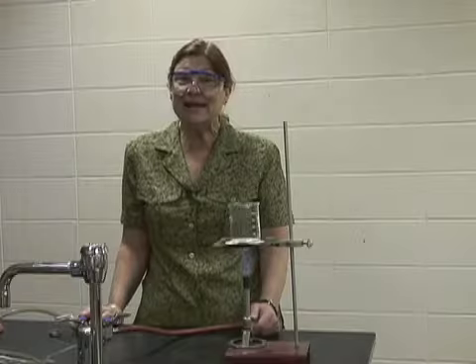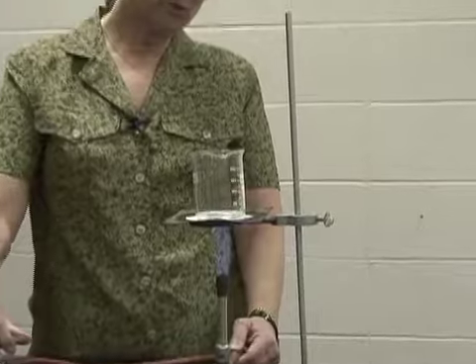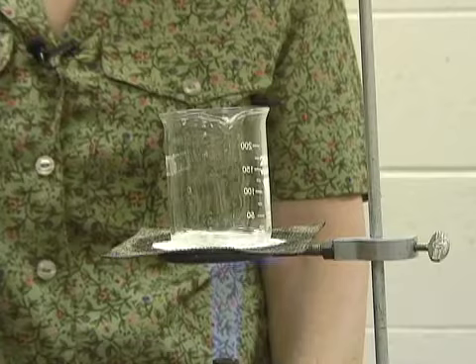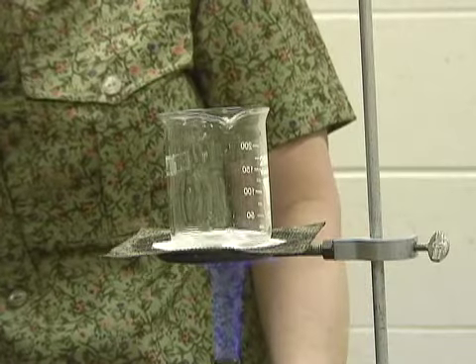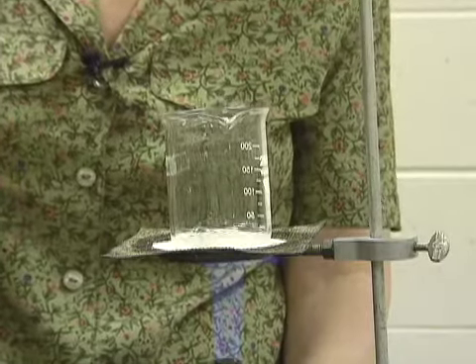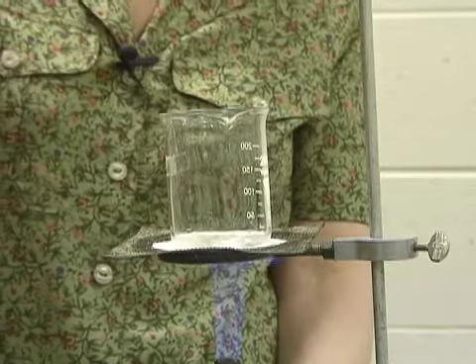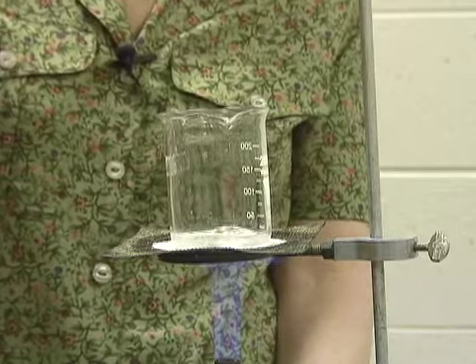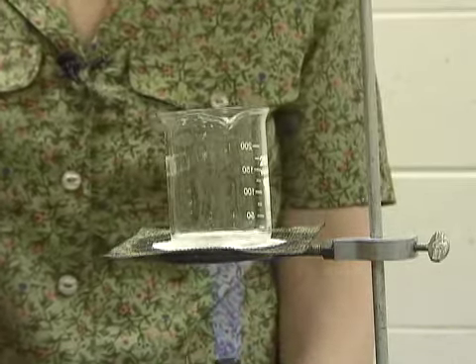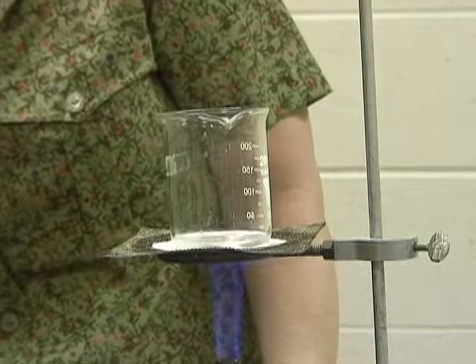I see it bubbling. That means it's boiling. Yes. Now, we don't want it to boil too vigorously, as it could splatter out. Oh, look at that. I'm watching it carefully. Now, that could be a source of error. If it splatters out, I'll turn it down a little bit so we can lessen that flame. Seems to be just right.